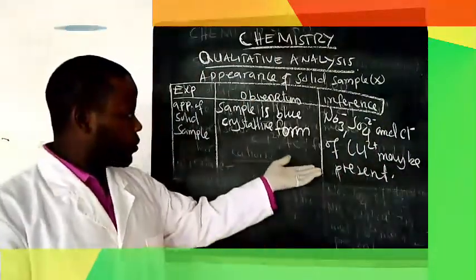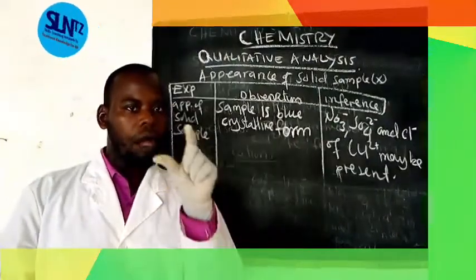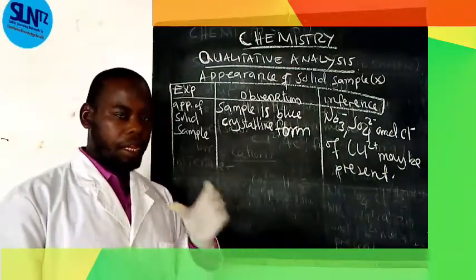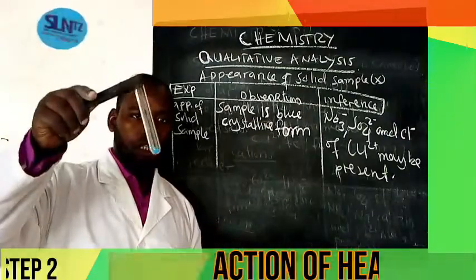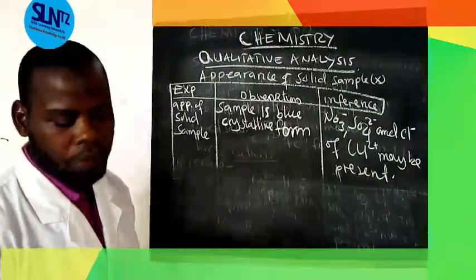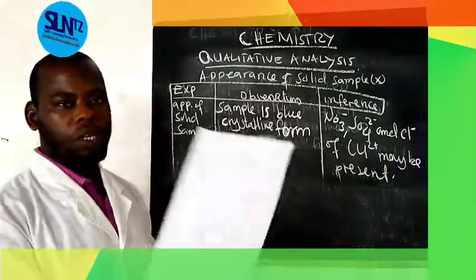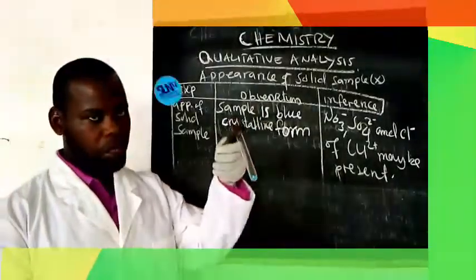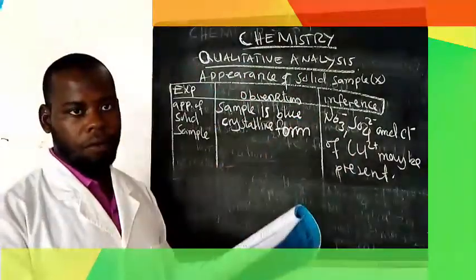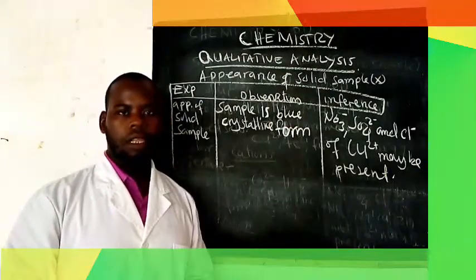And we are going to proceed with our report. This is appearance; I will write here how you have to show the action of heat. We heat this one, we see the observation, and we are going to present it in our report. Make sure to have a guide sheet in order to see the observation and make a correlation between the observation and your guide. This is the guide for all level examinations. Let's go to the experiment to heat, and then we'll come back.